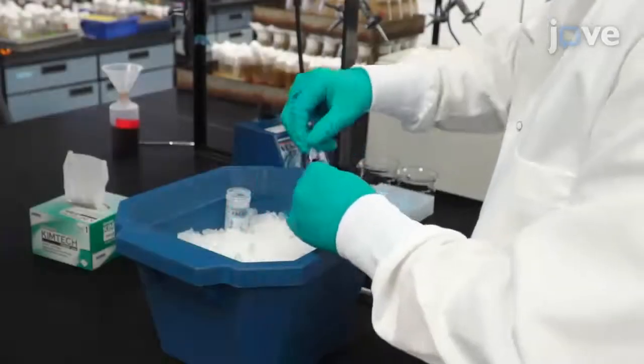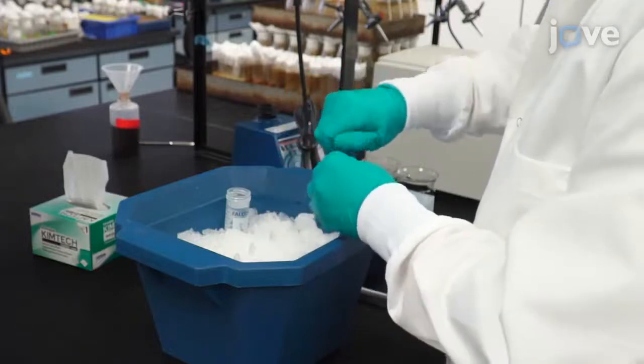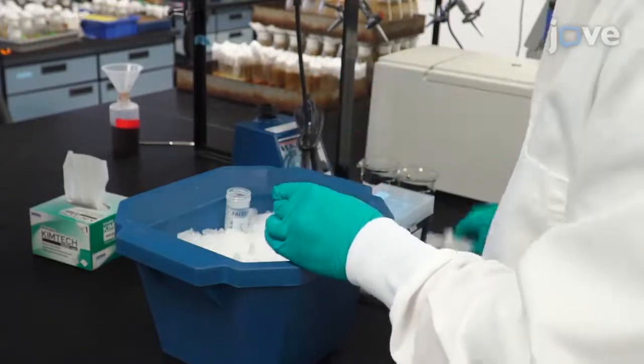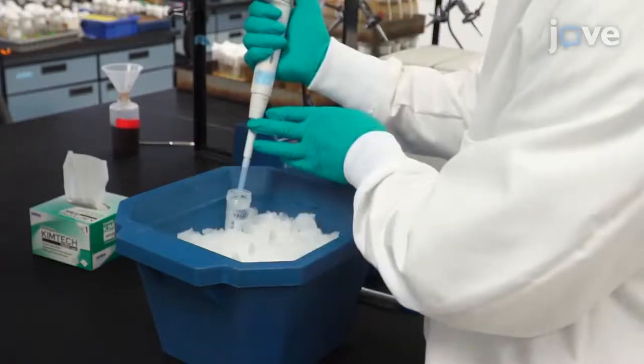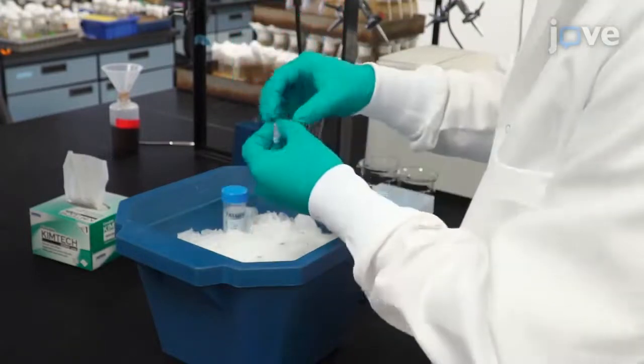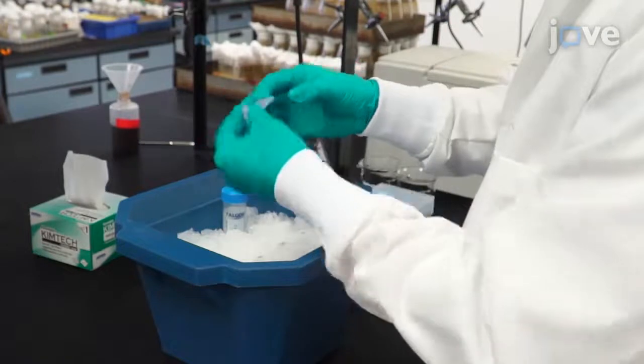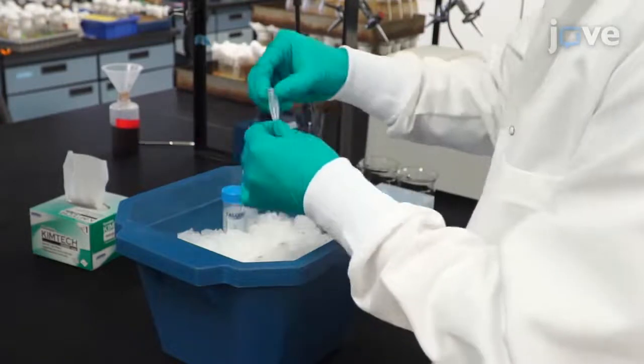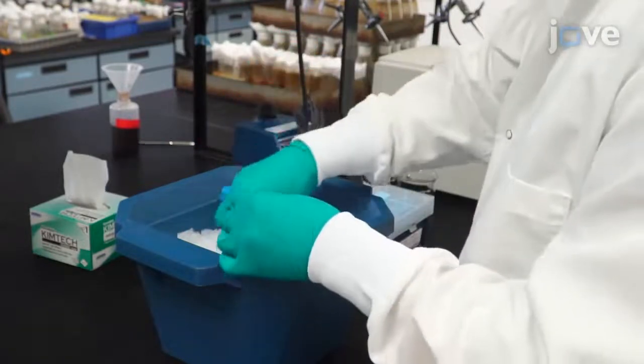To begin the protocol, add one milliliter of ice-cold 0.9% sodium chloride into a 1.5-milliliter tube containing previously prepared larvae. Close the lid, vertically flip the tube to thoroughly wash the larvae, and place the tube on ice for 30 seconds.